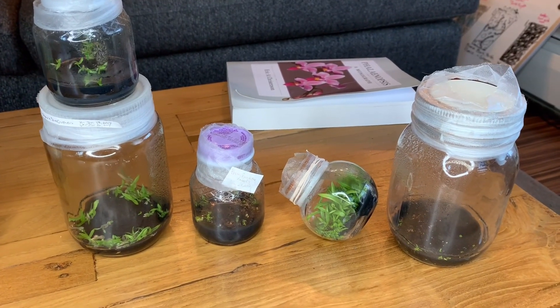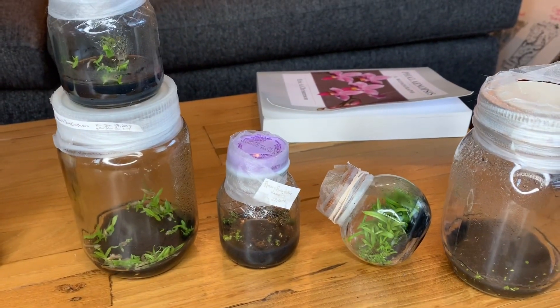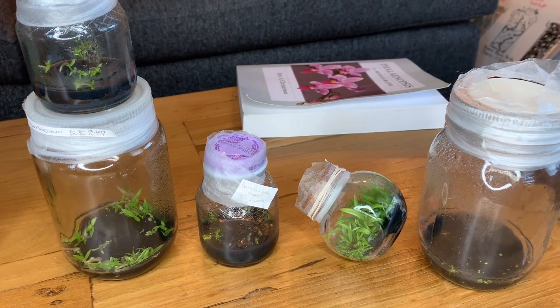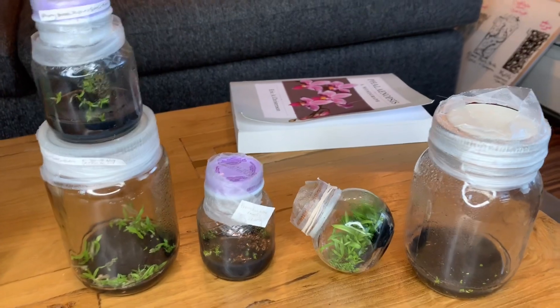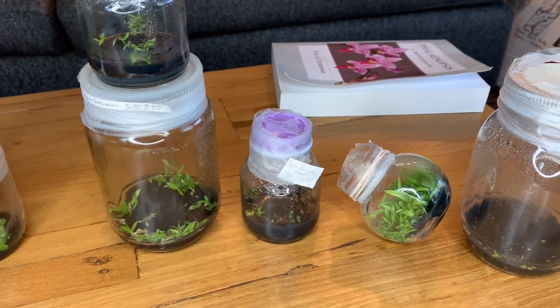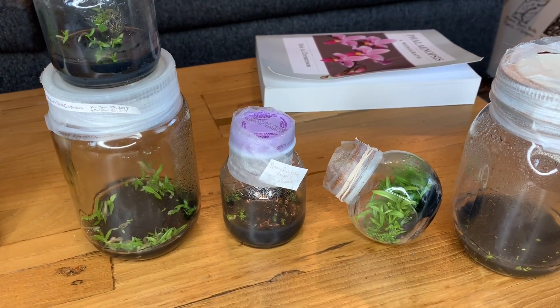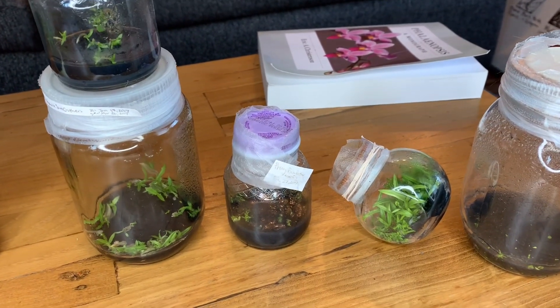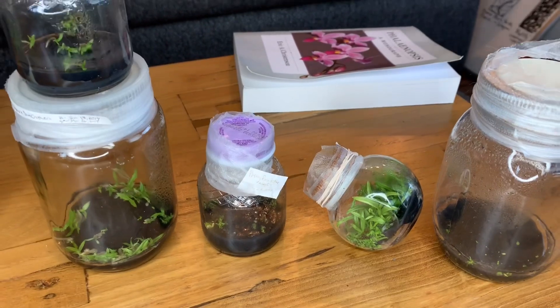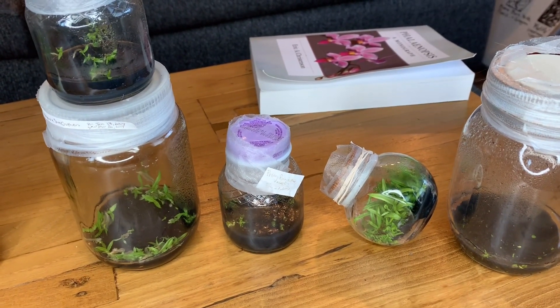Last are the Fragmipediums. They're doing really well, picking up a lot of speed. I did lose a couple more flasks to contamination — I've decided I'm no longer using those square flasks. Every single flask I've had of those square ones has ended up contaminated. With the exception of one threaded cap on this style of jar, I've only had one contamination out of all of these, whereas the square flasks were literally all of them. I think you can probably use them if you have a stabilized environment, but I'm in Canada — on hot days our apartment goes up to 30 degrees Celsius, and on cool days it goes down to about 16 degrees Celsius. I think that creates a pressure differential inside the flask, which creates a pull or suck of air that introduces contamination, because it's typically always been on a cooler day that I've found the contaminations happen.